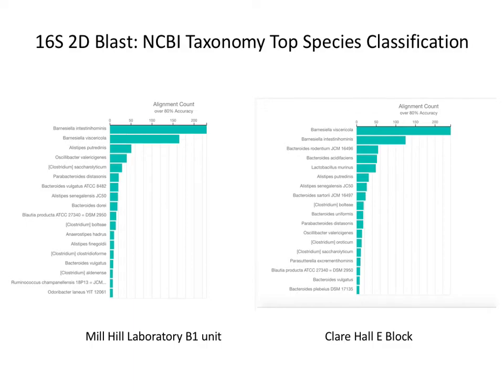You compare that with the Illumina short reads. Yes, and we get less unclassified with doing the longer read, but you get roughly similar proportions. Similar proportions, yeah. But there are obviously biases in your primers. Sometimes they leave out a taxon or downgrade it, and I guess that would vary whether you're using V3, V4, or length. Then you're using the long read biases. Yeah.